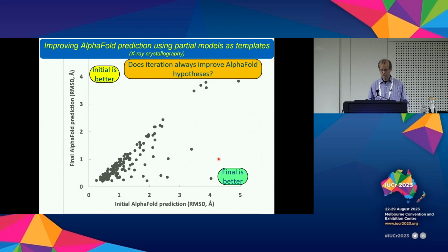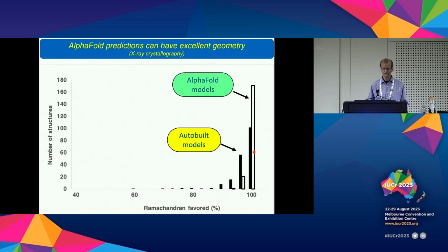Those that are below the line, the last AlphaFold model is better than the first one. So it's not always better, but often it is. That gives you an idea that it's worth a shot, particularly since this whole process doesn't take all that long and is pretty easy for you because the software can do it for you. So why not?